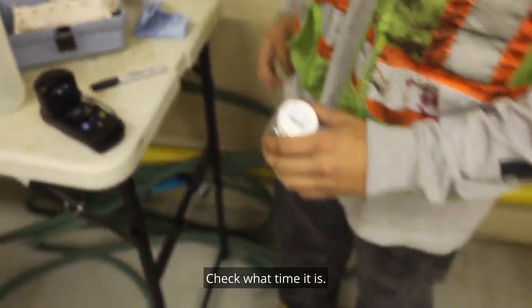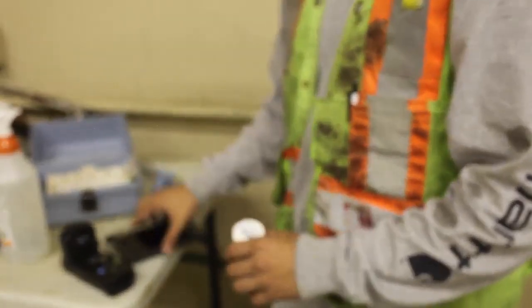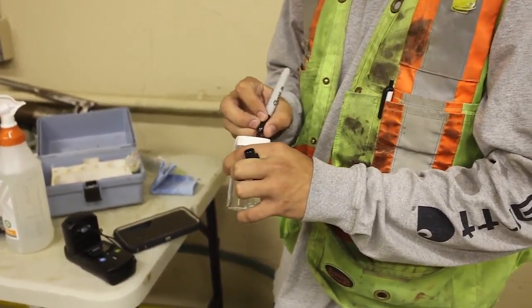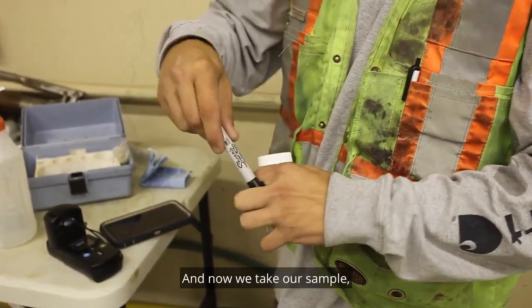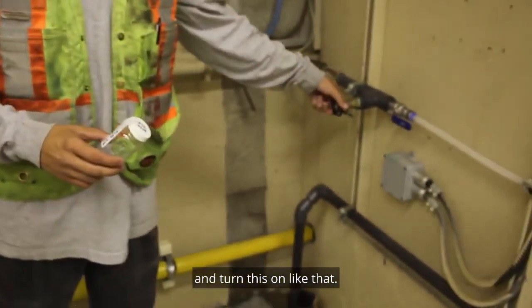Check what time it is. And now we take our sample. Let me turn this on.